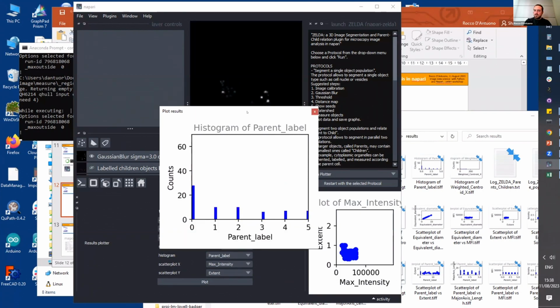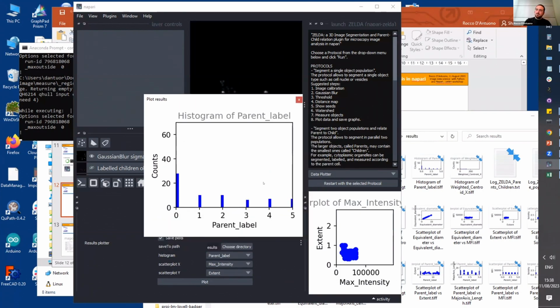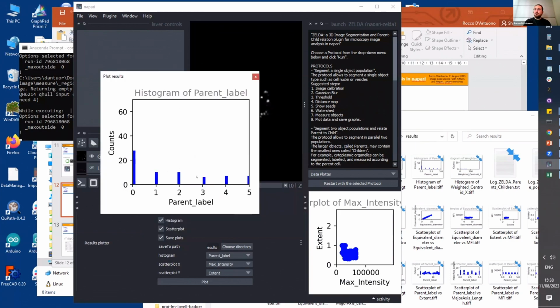the great work that Marcelo has shown. But this was back in 2020, the easiest technology I found. So what you will have is a plot that is automatically rescaled using the data that are contained in the plot. And now you will see, for example, that there is one object that has many children, another that has fewer, a bit more.